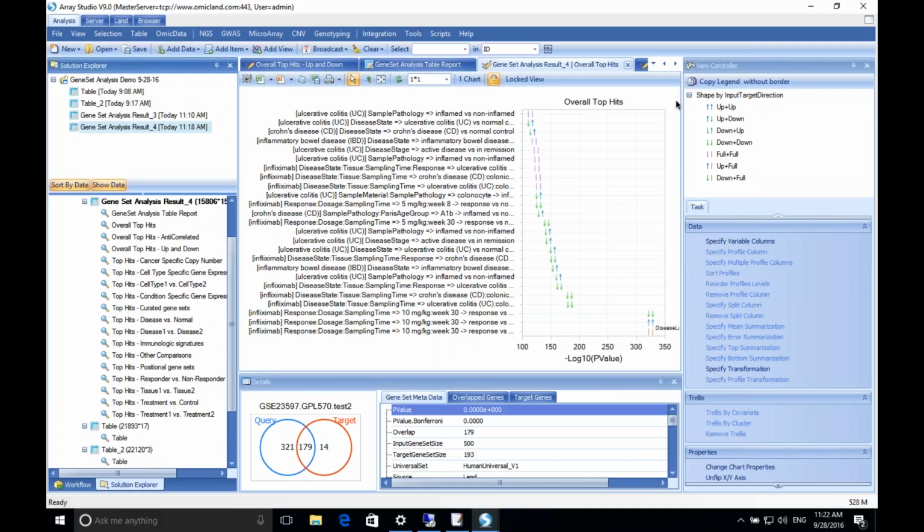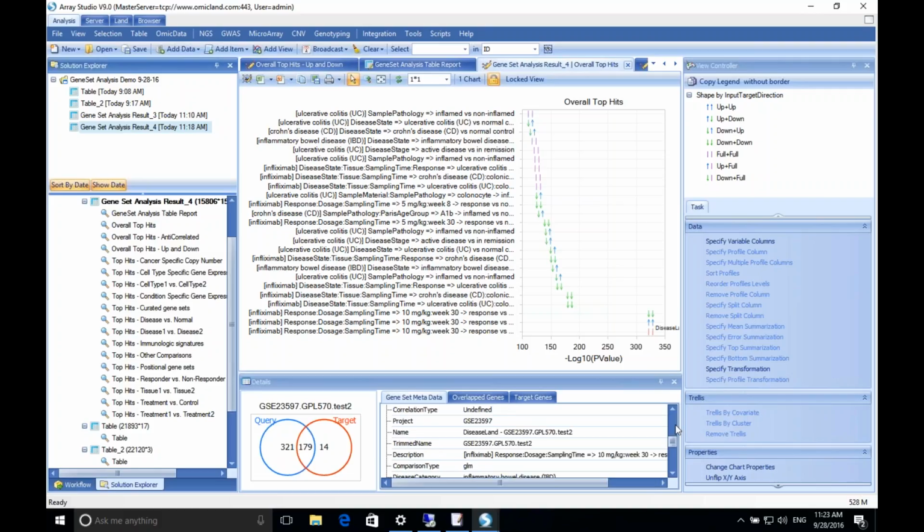And then there's another question about what information about gene sets is stored other than the list of genes themselves. For the land-based gene sets, you'll see that we're storing all of the metadata associated with that. This is a really long description, but it's going to tell me that it's in IBD. The disease category was IBD. The state was colitis. The dosage, the platform. It was responder versus non-responder. It was expression analysis and so forth. This obviously will change depending on what you're picking.